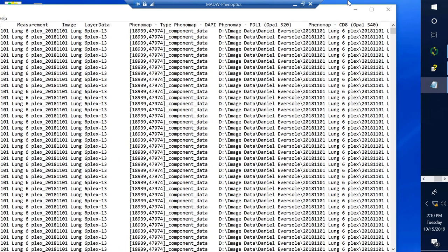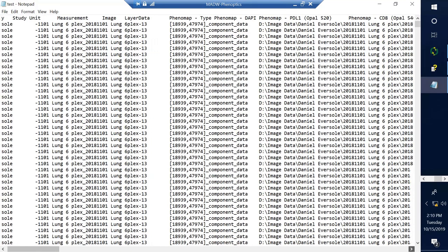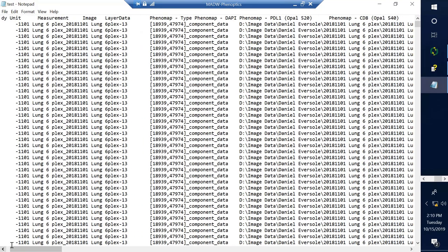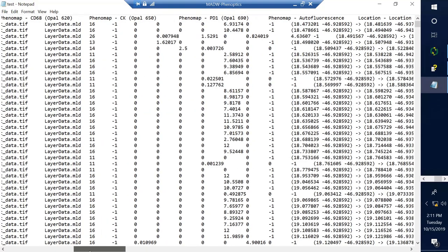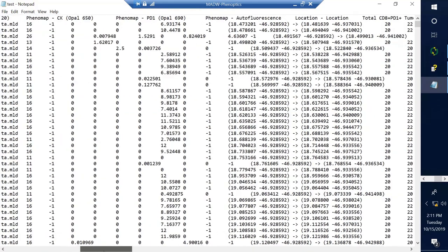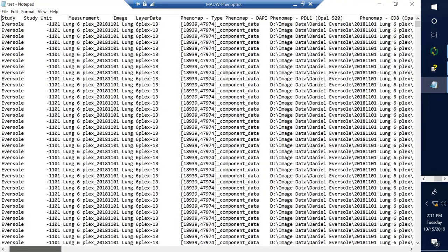You can also create this into an Excel file. So you can see that every line of data has been represented. Every cell is represented on this data sheet. You can use R scripts to consolidate this file for more analysis, for a deeper look into the analysis.